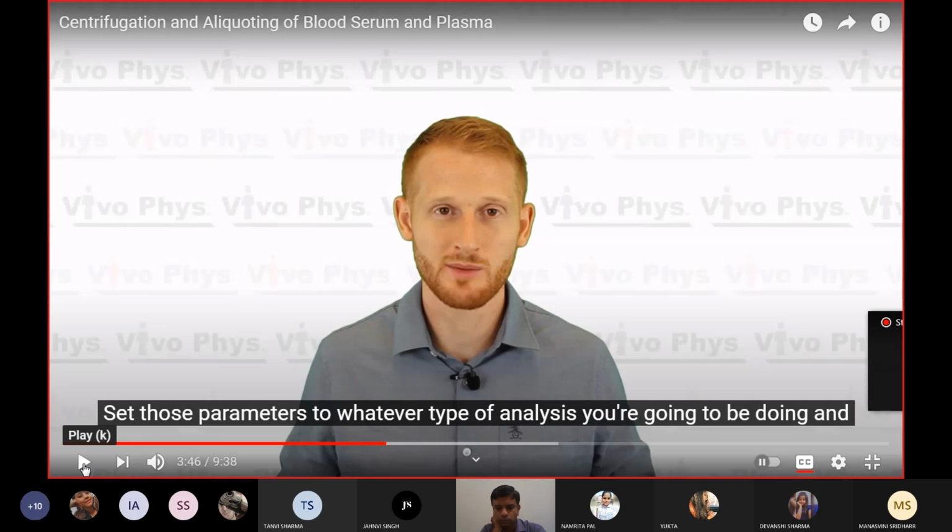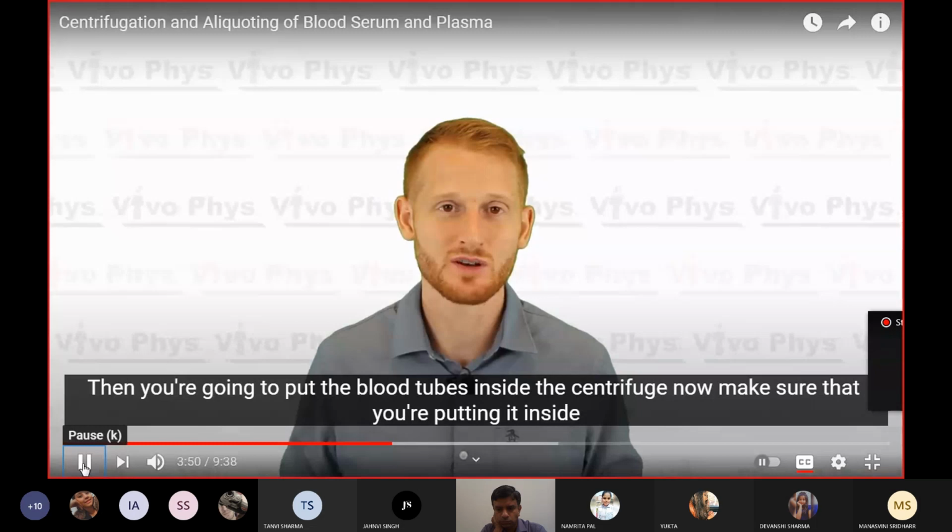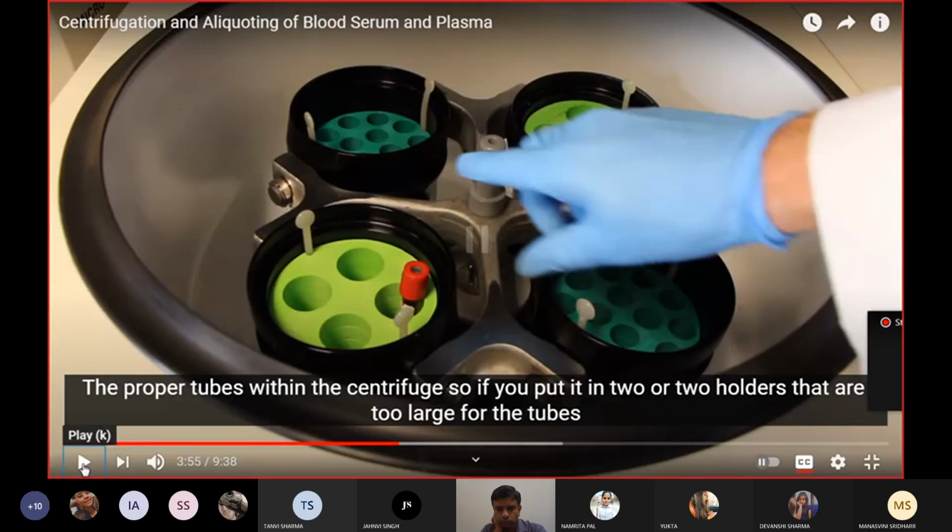Set the parameters for whatever type of analysis you're going to be doing, and then you're going to put the blood tubes inside the centrifuge. Now make sure that you're putting it inside the.